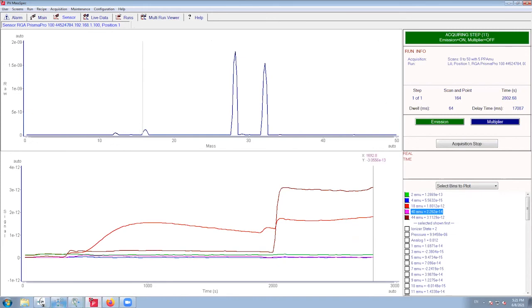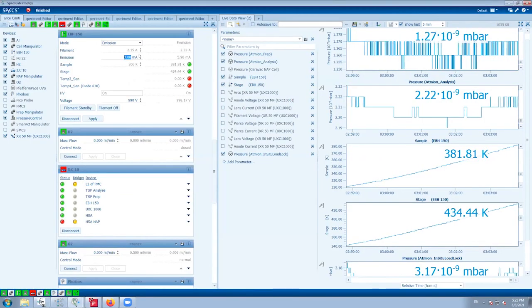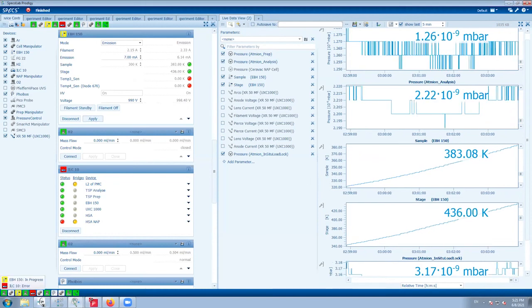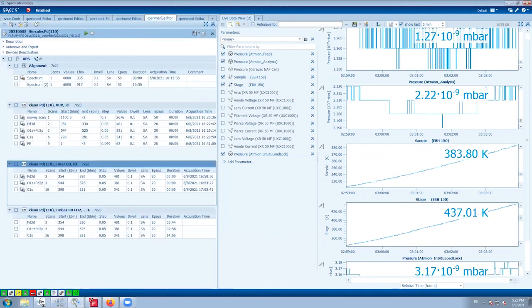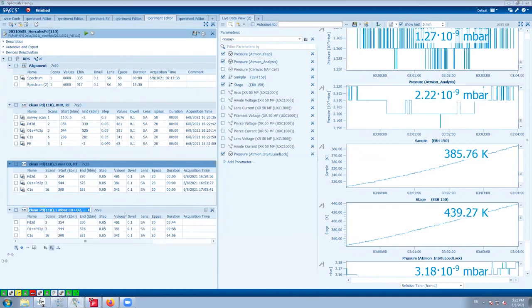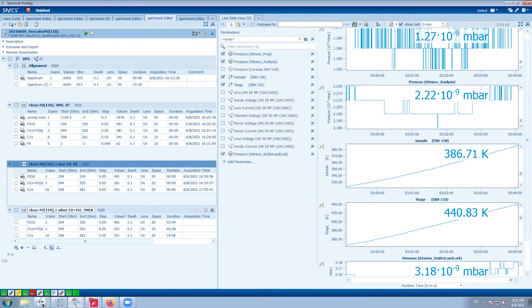You can still heat up a little bit more, and start a measurement just to see at least carbon 1s, if it's different. Then we can measure at higher temperature. So the group is prepared, right? Let's try to measure carbon 1s first, more or less. It's still growing, however.